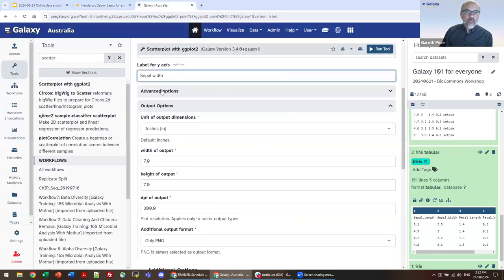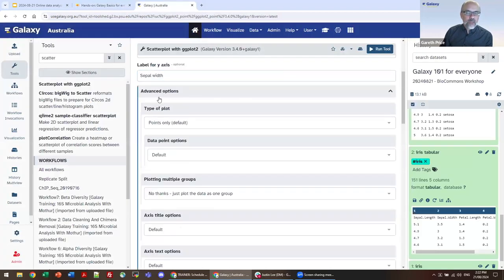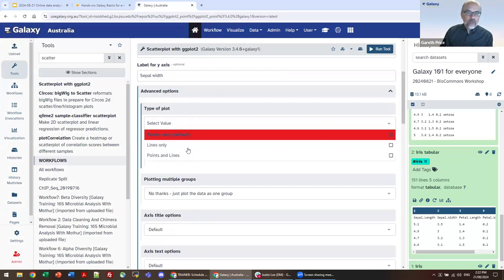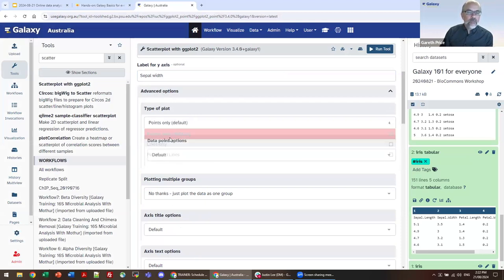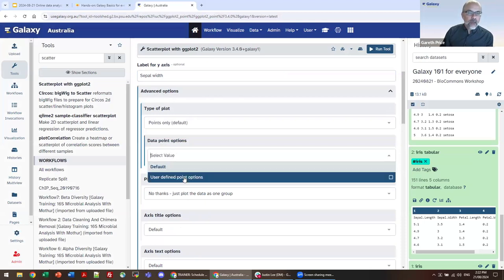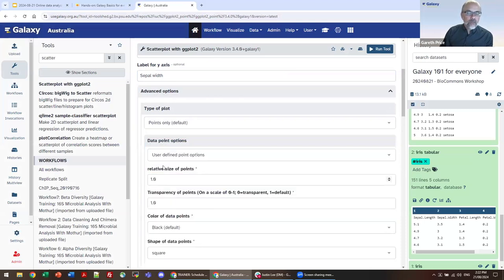We're also going to set a few advanced options in preparation for getting the exact graph we want, rather than rerunning after seeing the initial result. The advanced options are collapsed by default. We're going for type of plot: multiple plots, and we have axis options as well. We can plot points, lines, or points and lines — we are going for points only, and we're going to define them.